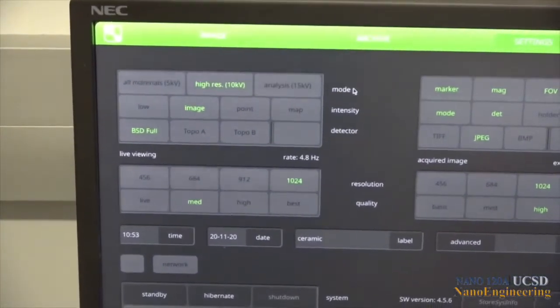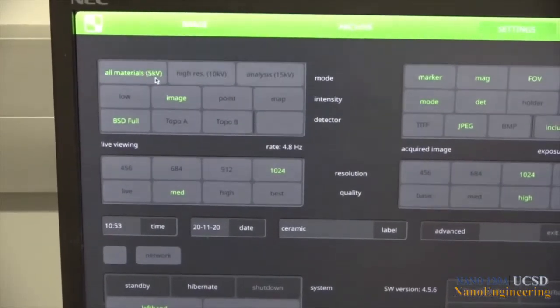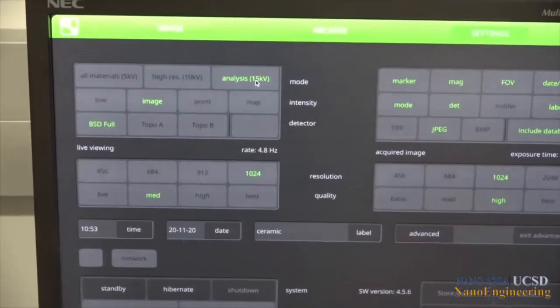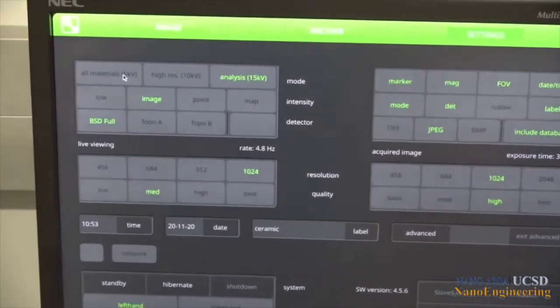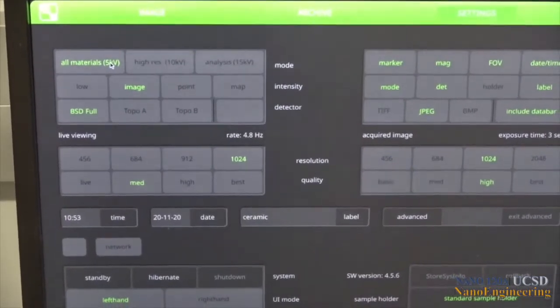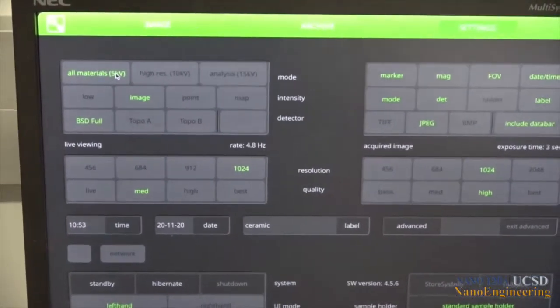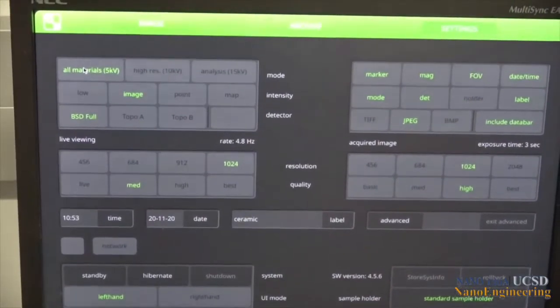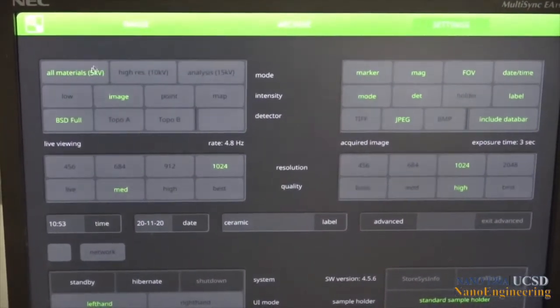When we click on settings, this menu comes up. The menu boxes on the left labeled mode allow us to choose our accelerating voltage of 5 kV, 10 kV or 15 kV. The 5 kV with its low sampling volume can be used for all materials, while the 10 kV is typically used for higher resolution imaging. X-ray analysis is usually performed with the 15 kV voltage.